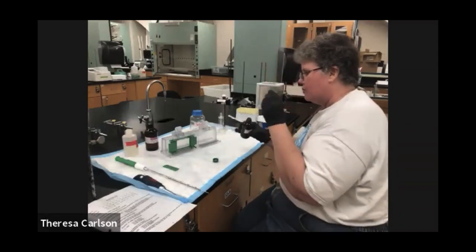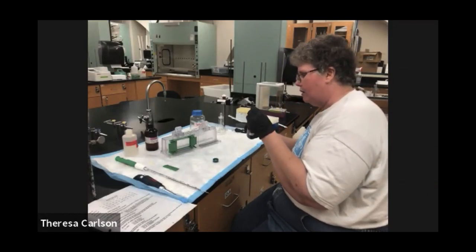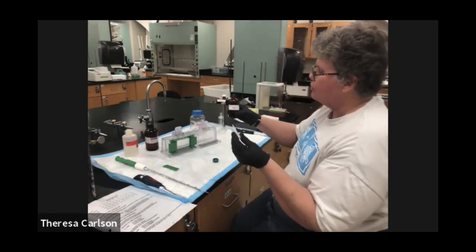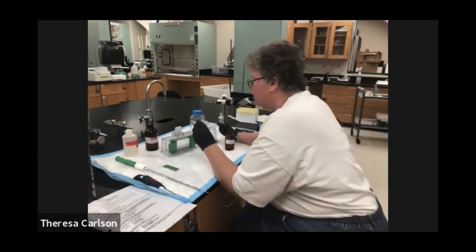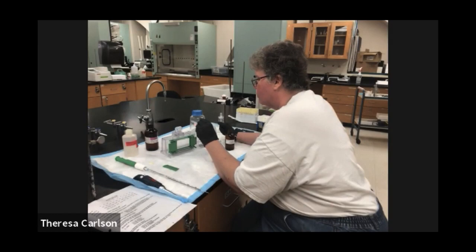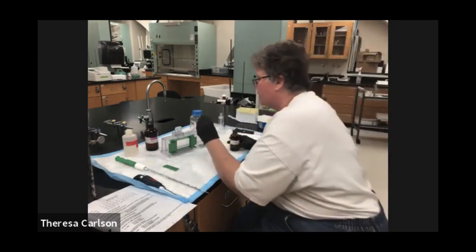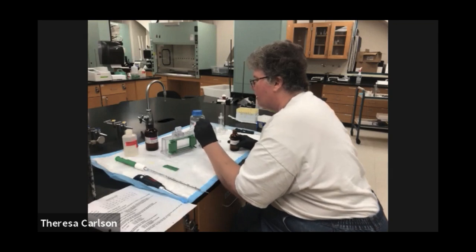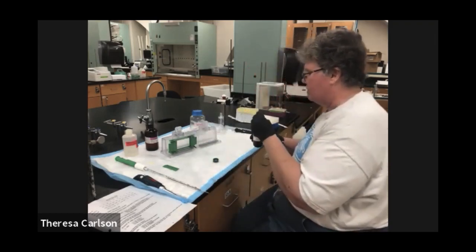rid of any bubbles. So what you do is you can put just a couple drops of T-amyl alcohol on top of your gel. Now, T-amyl alcohol must be saturated with water. It's hygroscopic and it'll suck up the aqueous solution if you don't have it saturated with water, which means there's two layers in there. So you need to know which one is the correct layer to add. So adding a couple drops of T-amyl alcohol just to the very top of the gel. We're not adding a whole bunch, just a tiny, tiny little bit.